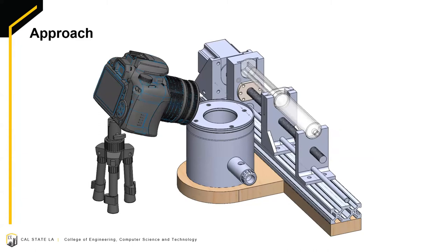Here we have a render of the experimental setup. You can see a syringe-based pressure application system on the right, a sealed pressure chamber in the middle, and a camera to image the sample. This is a visual representation just to show the components of the setup and not exactly representative of the final results. The pressure transducer used to measure the pressure and the camera will be connected to a computer for data logging.